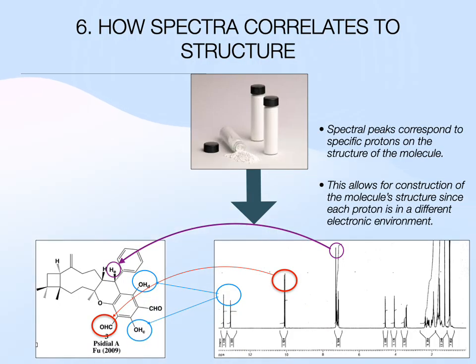So, having generated our spectrum, we're now in a position to be able to connect the spectrum, as in spectral peaks, to the actual compound structure itself. And so we see that depicted here in a color-coded fashion, where the purple peak, or the peak that is circled with the purple circle, is actually connected to the proton that is seen as He in the molecule.